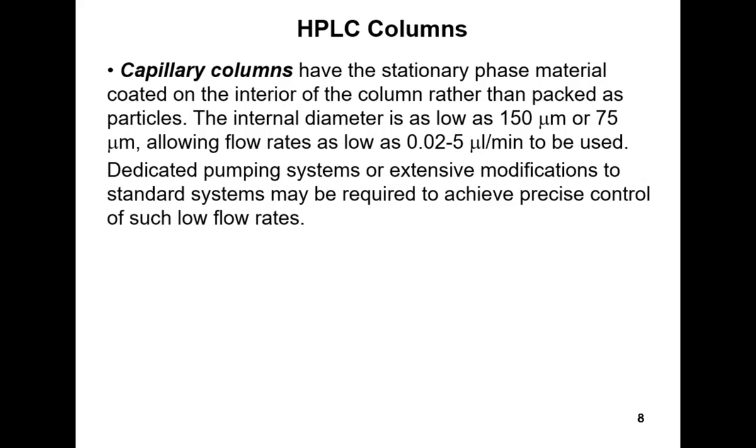And so the internal diameter of these capillaries would be much less than a millimeter, 150 or 75 micrometers, and the flow rates for the mobile phase, so the liquids going through the middle of this capillary, are just a few microliters per minute or less.